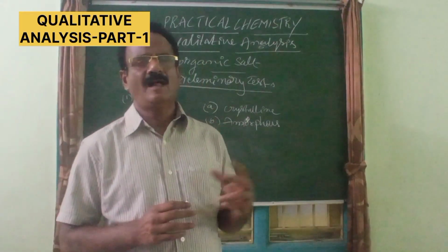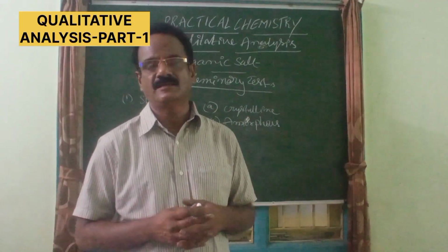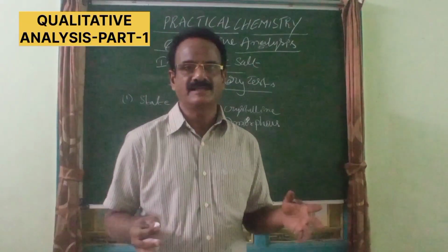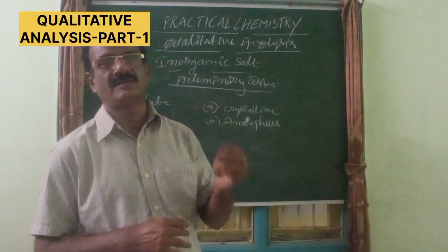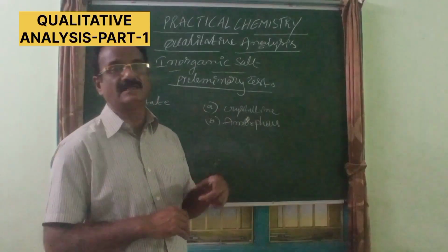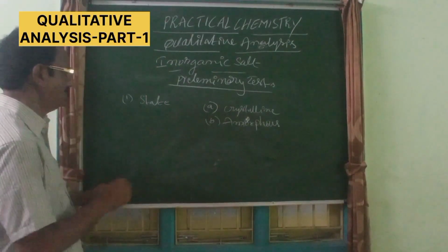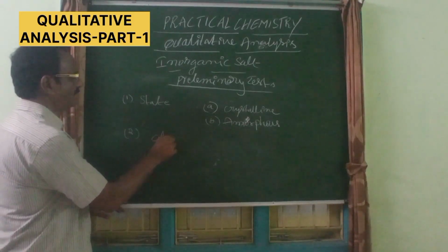Almost all salts given to the analyst, or to students in the case of colleges, are in solid state, so there is no issue about whether it is solid or liquid or gas. Our observation is confined to whether it is crystalline or amorphous. Is it clear? Now let us see another most important observation: color of salt.